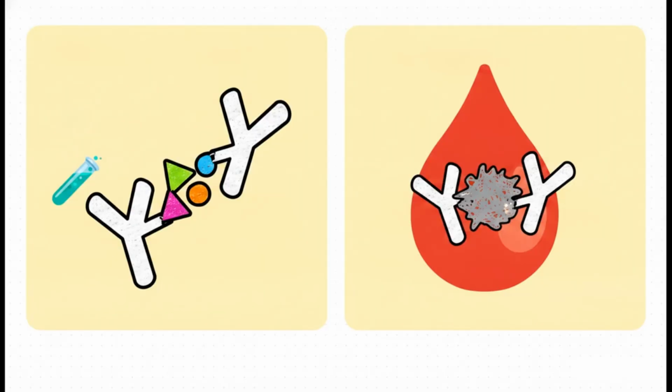Step 3. Separate antibody promiscuity from actual matrix effects. You do this by observing your samples in basic buffer conditions versus native matrix conditions. If your false positive completely disappears in a clean buffer, but roars back to life in the native matrix, you know for sure you're dealing with a matrix-mediated bridge, like a heterophilic antibody. But if it shows up in both conditions, your antibodies are likely just promiscuous and binding the wrong target directly.